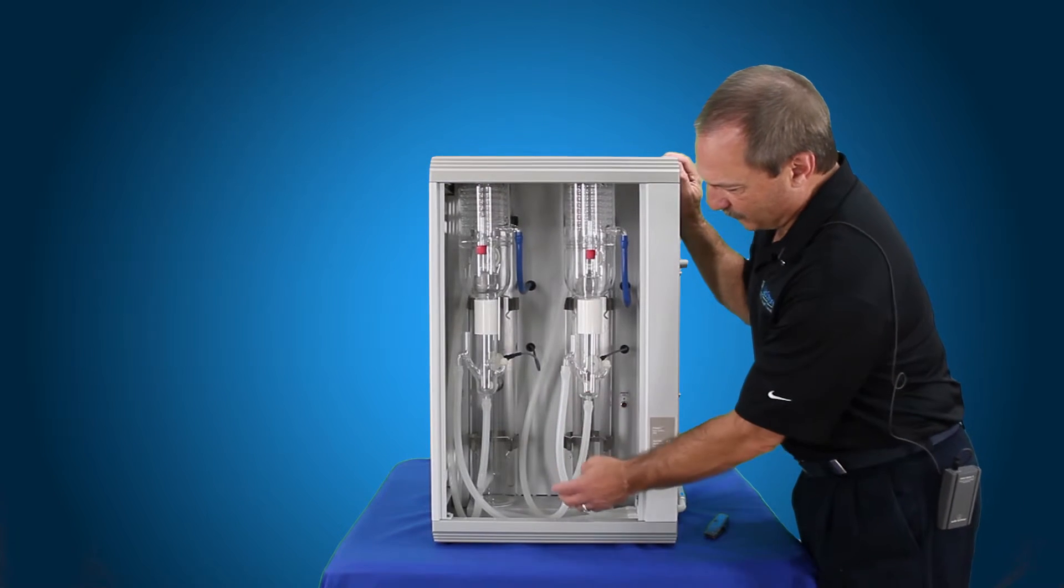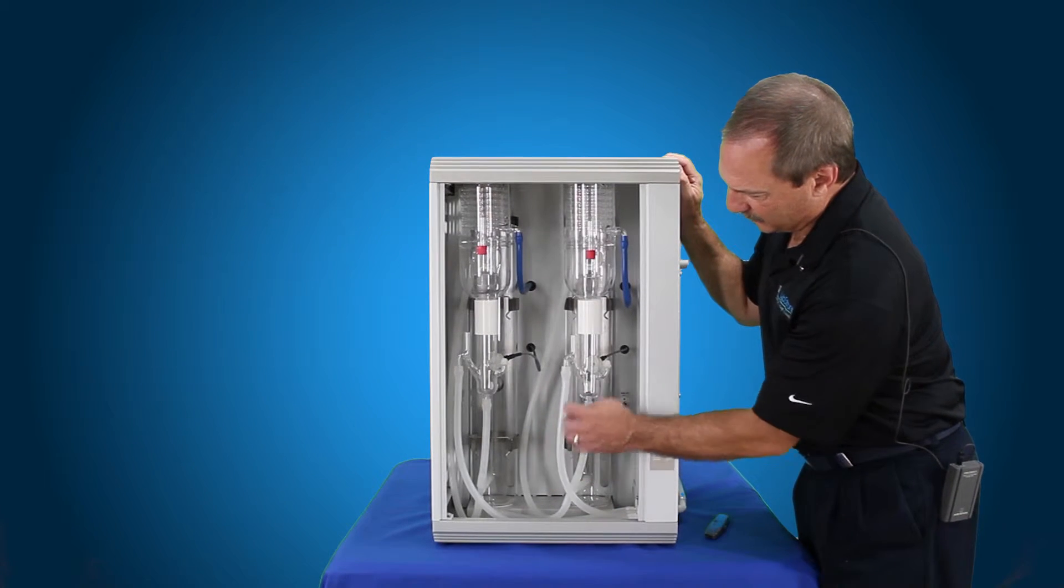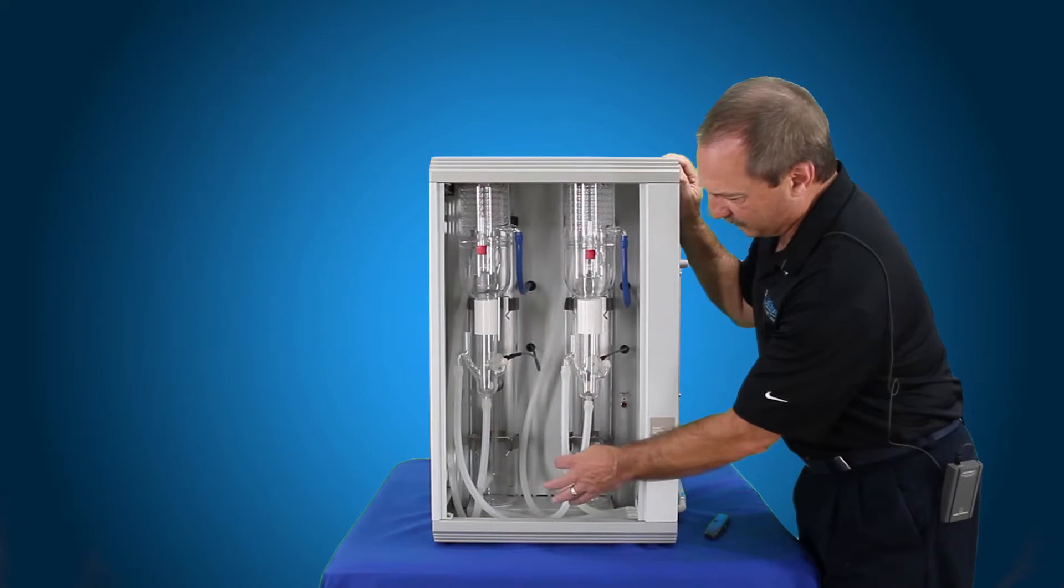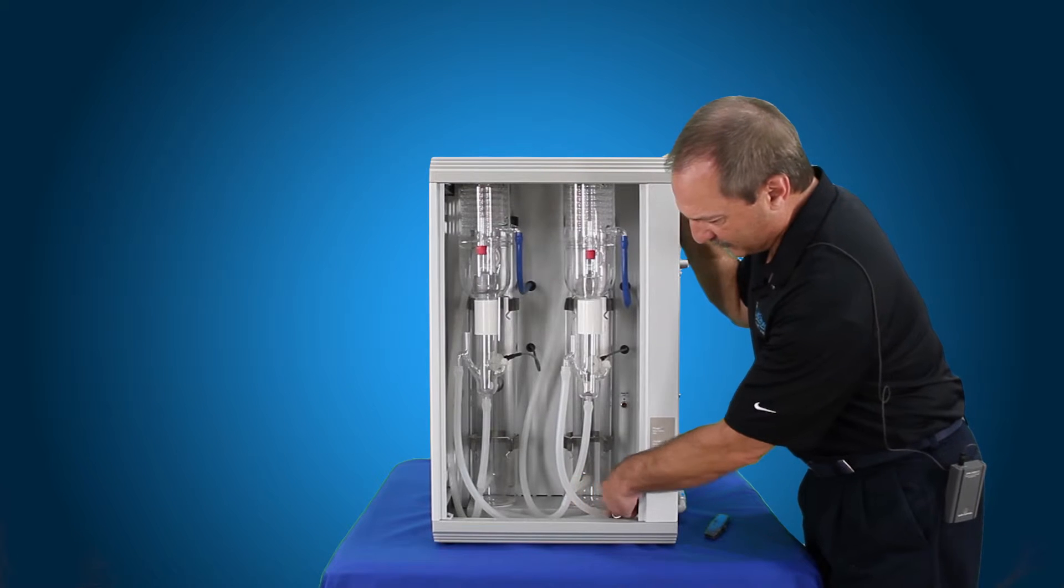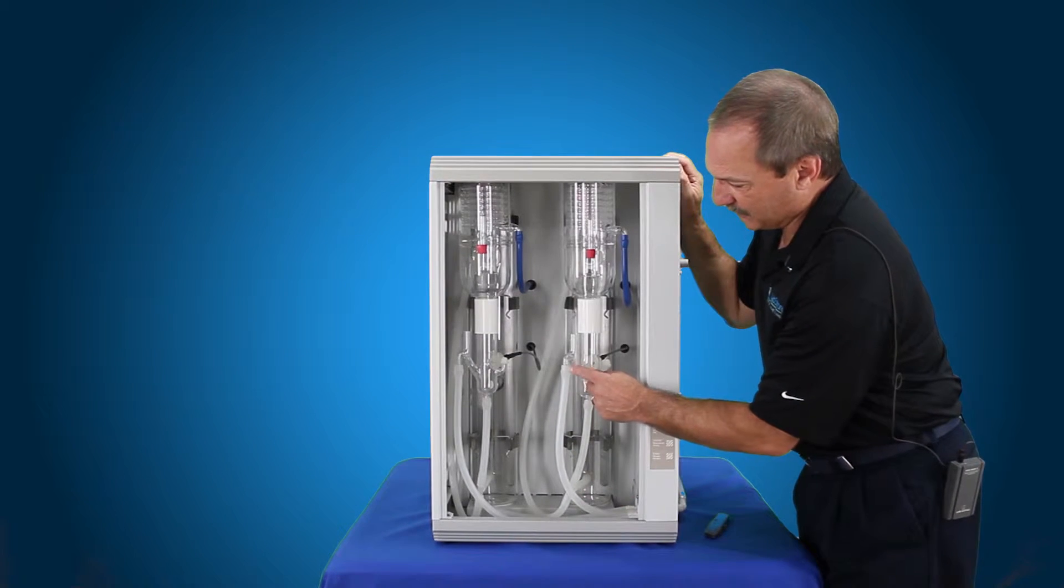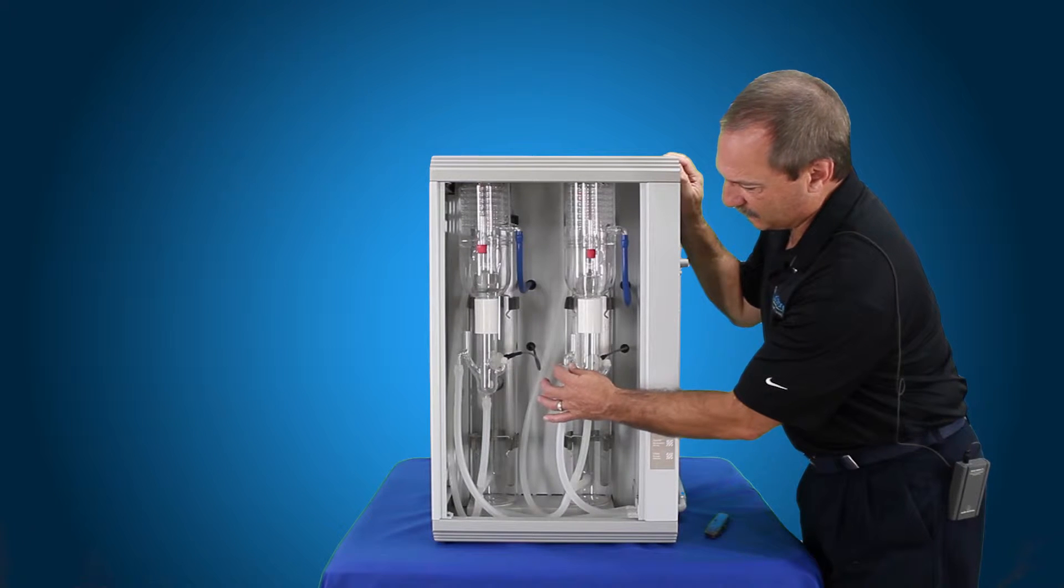Now what we're going to do is replace the overflow tubing from the constant level device that goes down to the drain valve assembly. This is a very easy piece to take off at the drain valve assembly because this does not get that hot, but at the glass right here the silicone tubing will adhere itself to the glass.